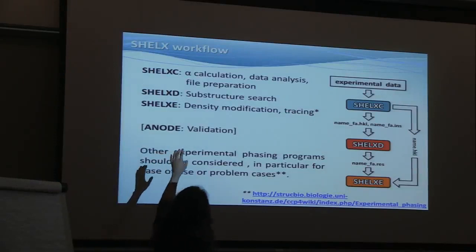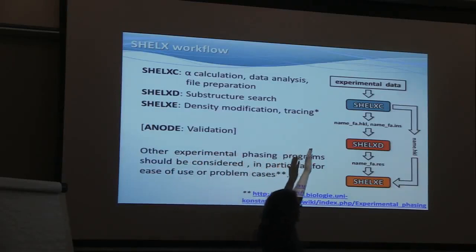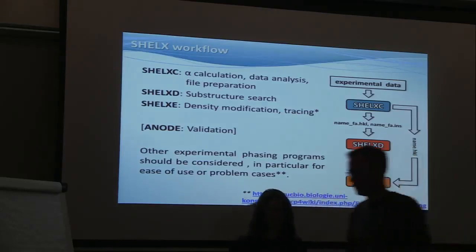So this is the SHELX workflow I have been showing a few times already. SHELX has 3 programs, SHELXC, D, and E. SHELXC does the data preparation and quality indicators and prepares the files. SHELXD finds the substructure, and SHELXE does the density modification.